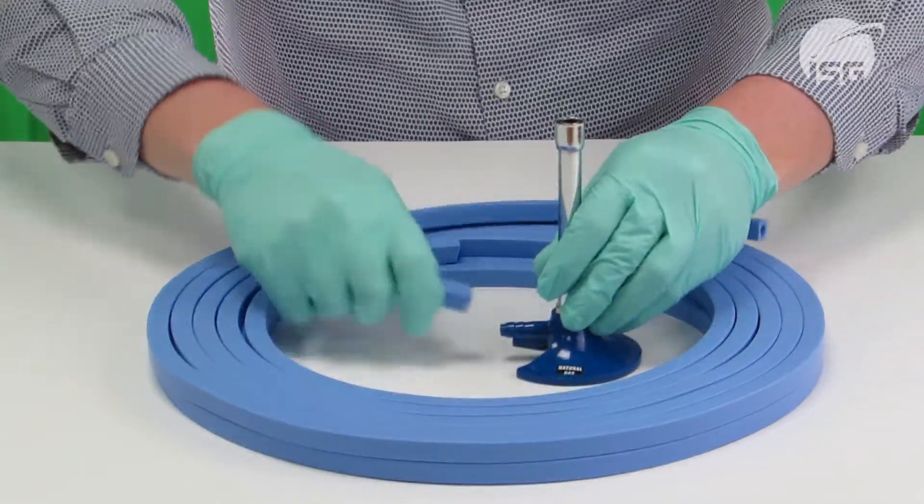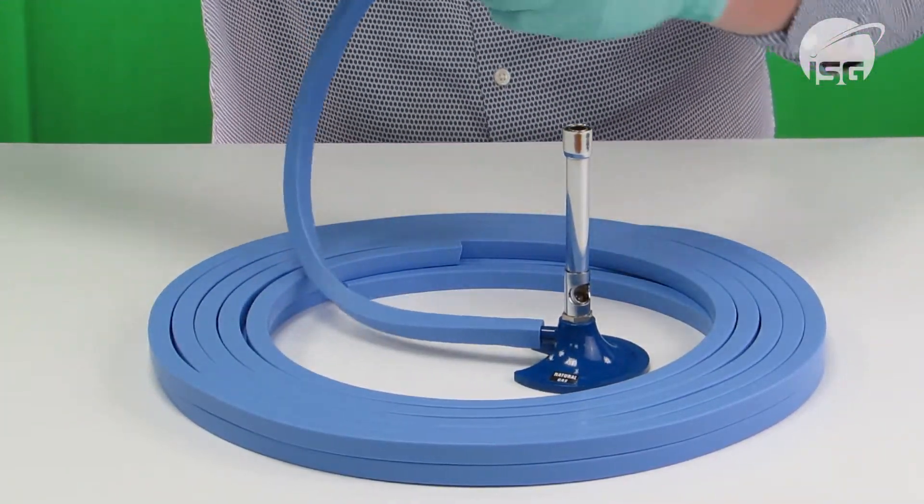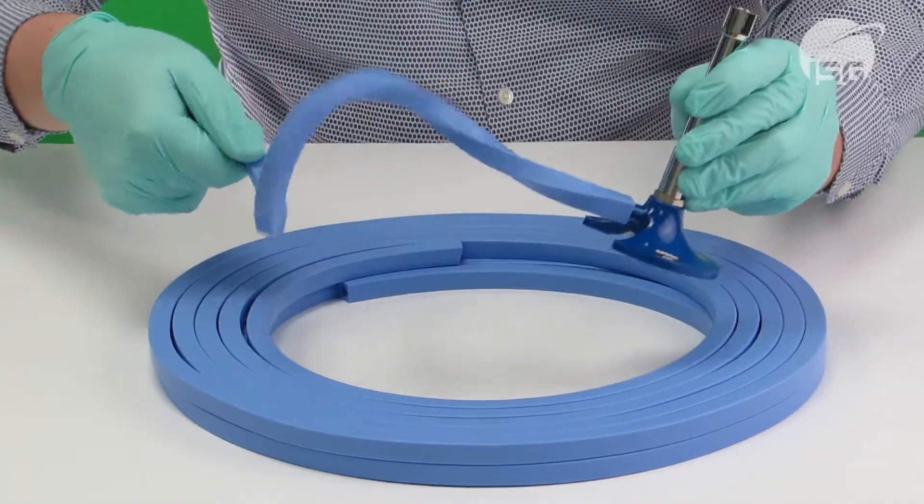The square form reduces kinking and allows the tubing to lie flat on the benchtop increasing stability when using with a Bunsen burner.